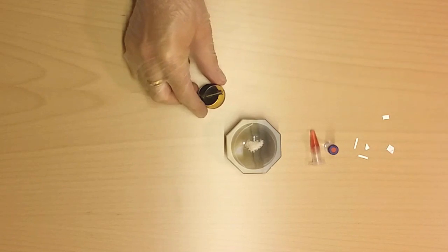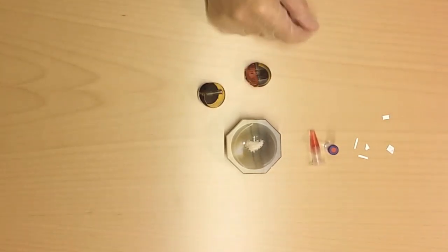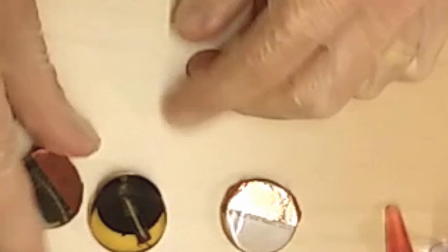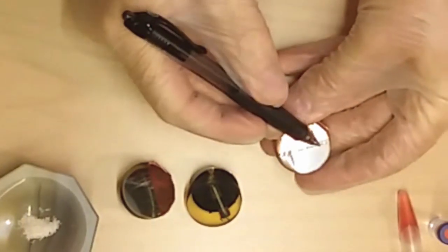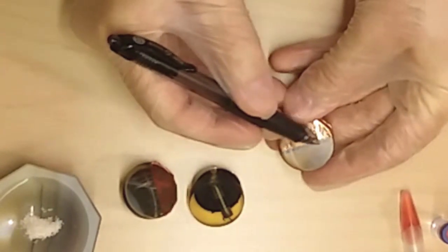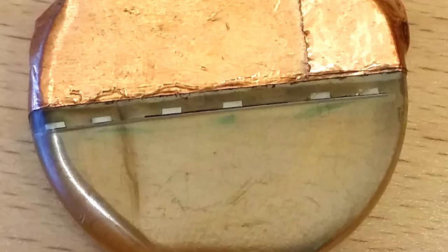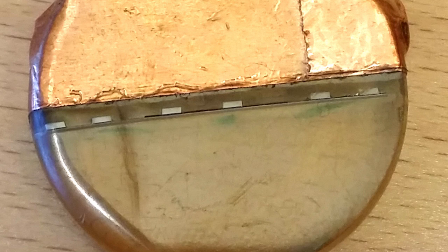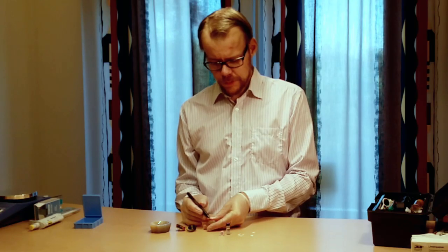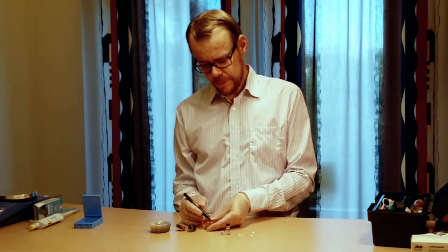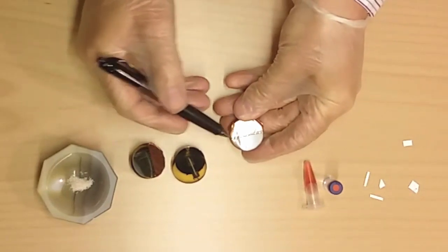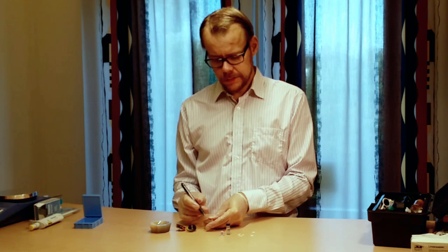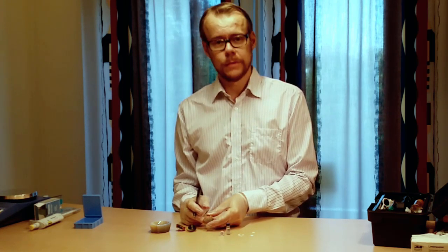Here I have a few samples that have been embedded in plastic like that. In this one, for example, there is a paper substrate with electronic components mounted on top of it. What you can see here in this plastic piece is that these small squares are resistors that have been soldered onto the paper. What we wanted to do in this particular experiment is we want to see the interface of the electric connection. That means we embedded this in plastic and then we grind it down and polished the surface. And then it can be analyzed in a scanning electron microscope.